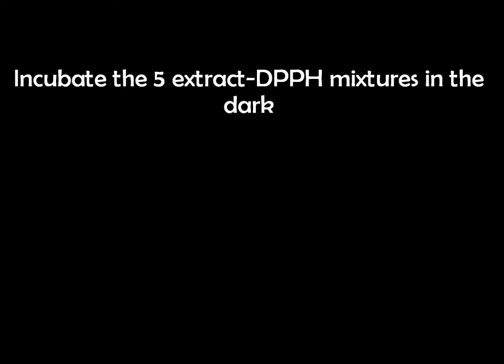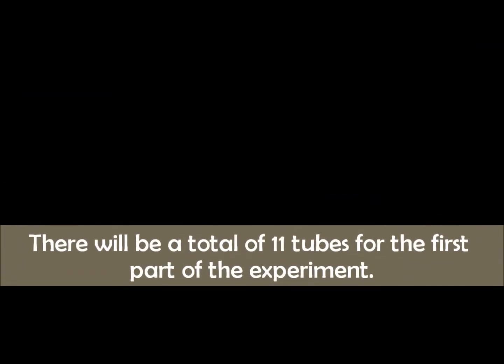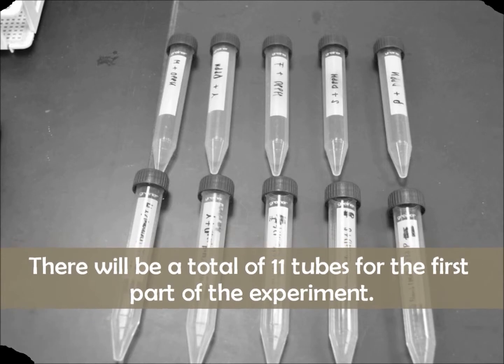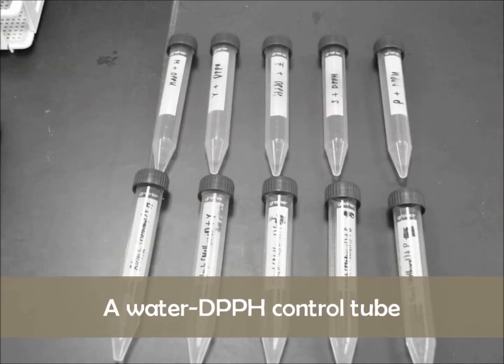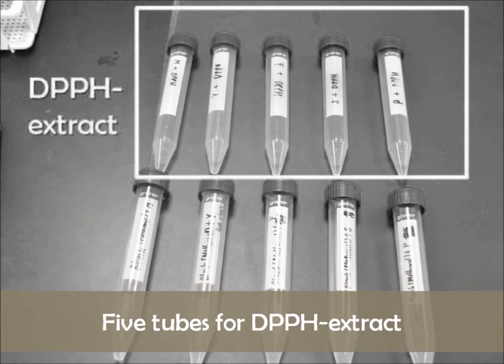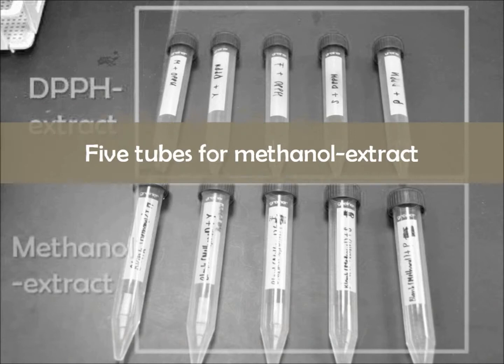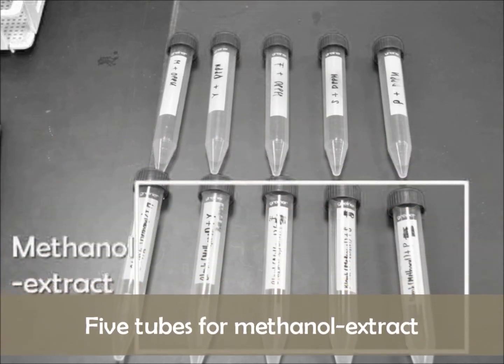Incubate the 5 extract DPPH mixtures in the dark for 30 minutes at room temperature. There will be a total of 11 tubes for the first part of the experiment: a water DPPH control tube, 5 tubes of DPPH extract, and 5 tubes for methanol extract.